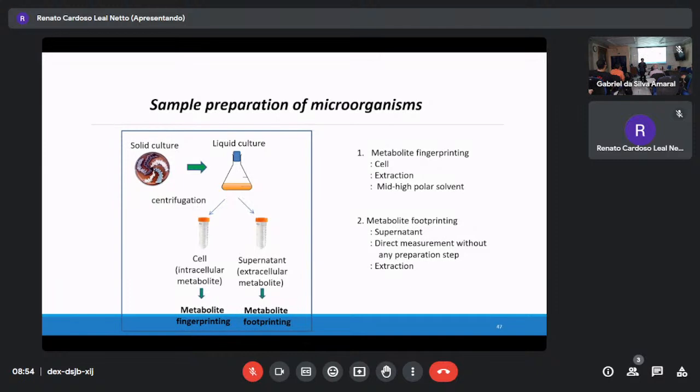That's why, instead of SPE, we are not using it often. You know which resin is quite commonly used in microbiome technology? HP20 resin. HP20 resin is the easiest one. It's like a filter for metabolites. You just pour it, take out the water, and then elute with methanol water or ethanol water. That is a little bit faster. Also the SPE method is a very small scale; if it's a big size, it's very expensive. HP20 we can use, but still, how to detect all of the excreted metabolites is the issue.